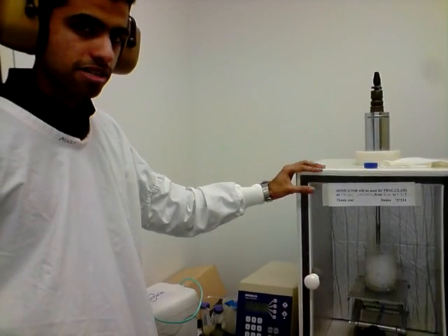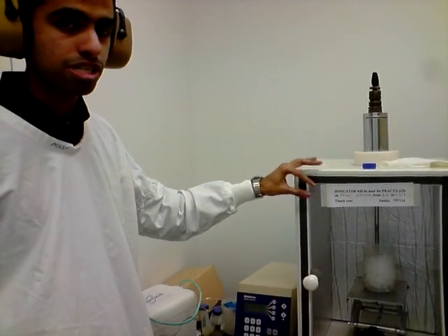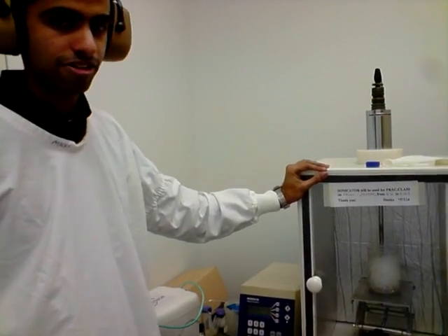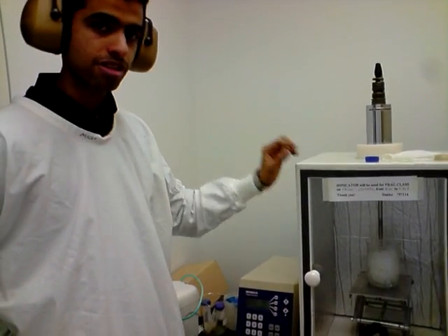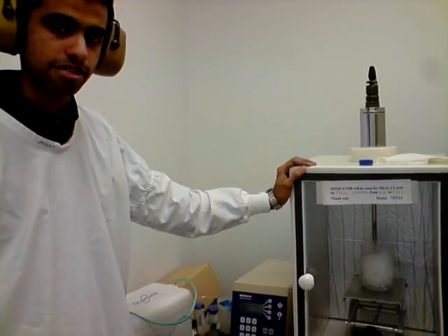With the sonicator high frequency sound, the cell walls will get ruptured and all the proteins will come out into the solution and get dissolved. When we give it back to you, you will be centrifuging it and the supernatant will contain all your proteins. And that is what we will be using for the Bradford protein assay.